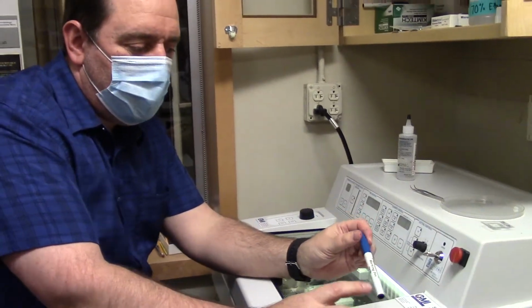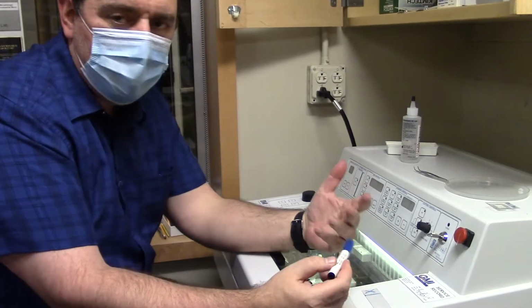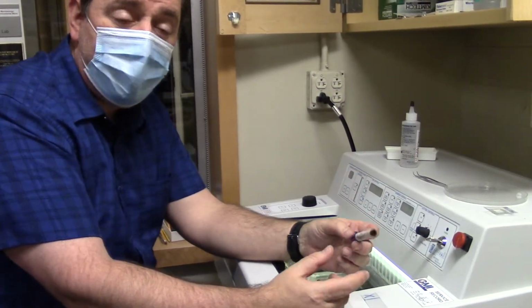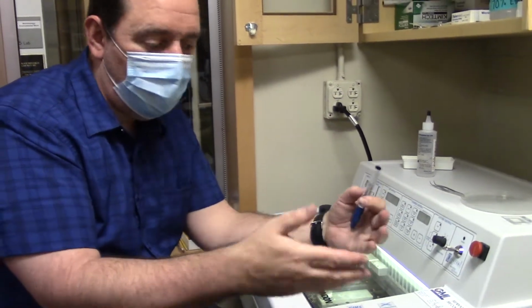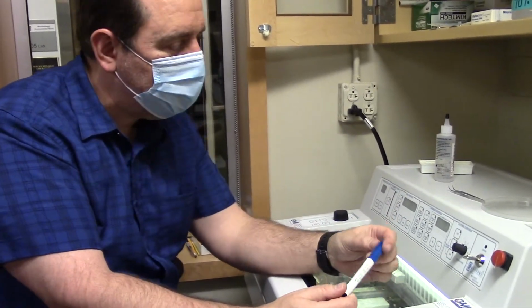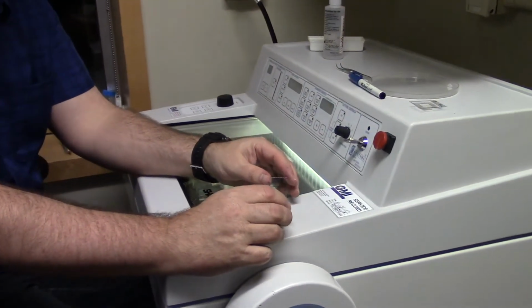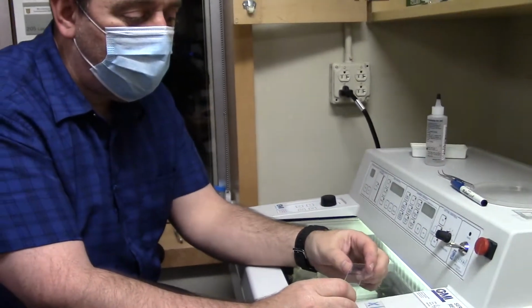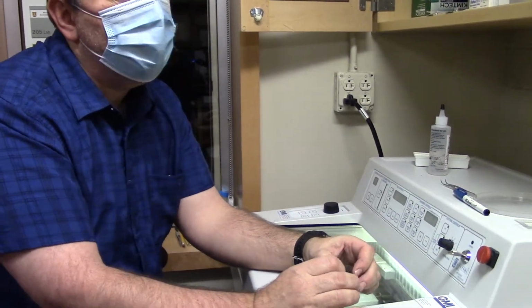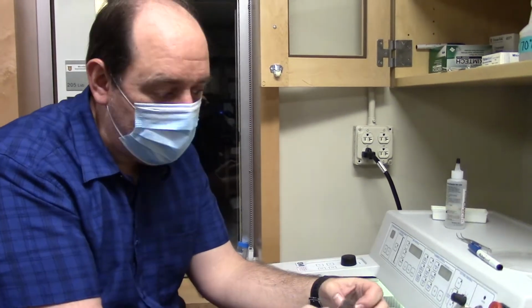So I've used this Fisher brand marking pen. This is specially formulated to mark really well on glass and also to not bleed when we do all these washes, the washing of antibodies over the microscope slides, etc. So we've got these special pens, and I've marked an X to indicate the slide that we're going to do negative control and have no primary antibody, and name for where you would put your name and your antibody's name and the name of what kind of tissue it was, like axolotl regenerating limb.